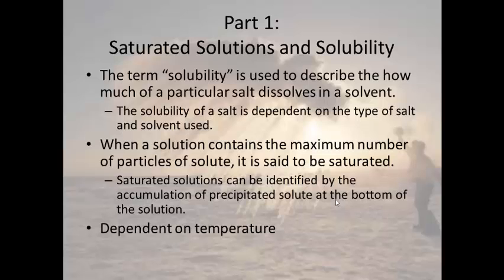And you can identify a saturated solution by once you've tried to dissolve as much as you can, you've stirred, you've waited long enough, and there's still a little bit of solute left in the bottom of the flask, then the solution above it is saturated. It's holding as much as it can.